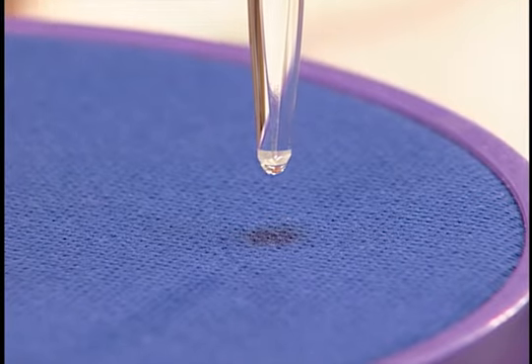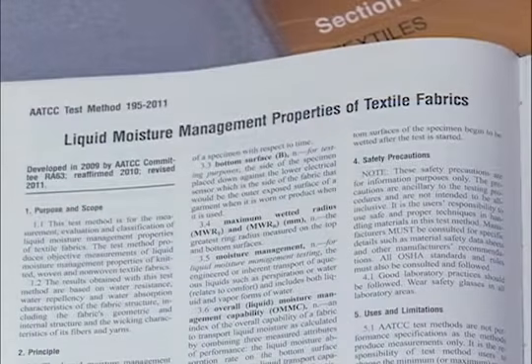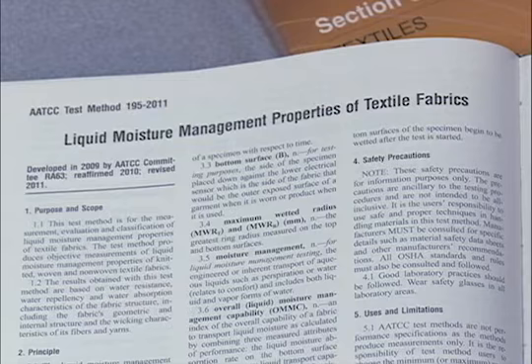The first moisture management test method to reach official standard status is AATCC Test Method 195, Liquid Moisture Management Properties of Textile Fabrics, 2005.